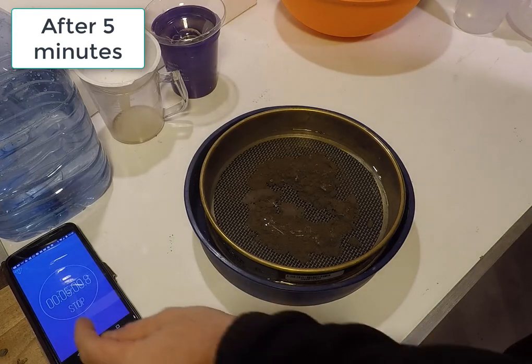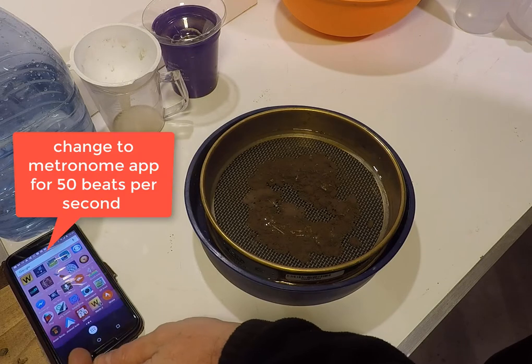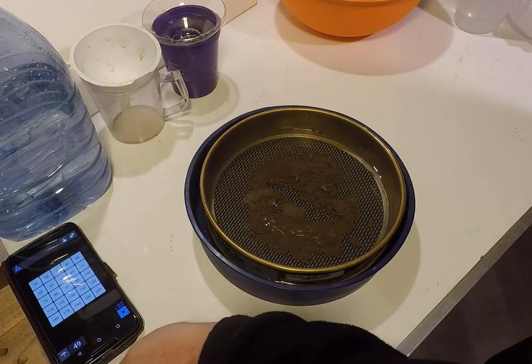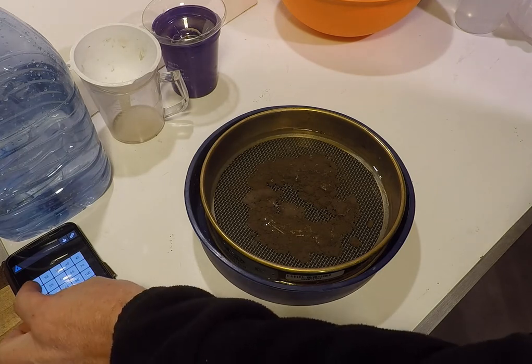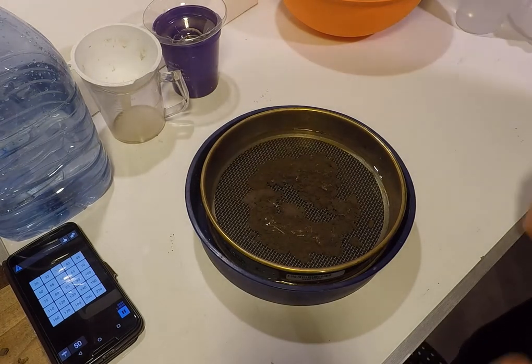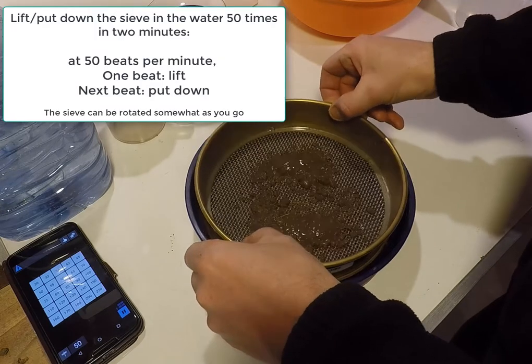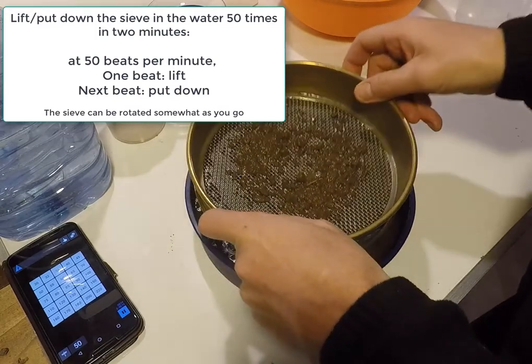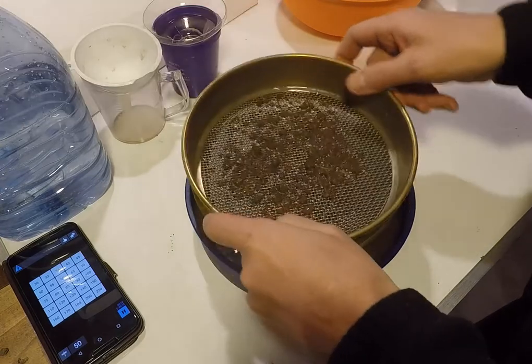After 5 minutes of soaking, the sieve is washed with an up and down motion, in and out of the water, 50 times in 2 minutes. A metronome app on a cell phone can be used at 50 beats per minute to time the washing. When using a metronome app at 50 beats per minute, the sieve should be put into the water on the first beat and then removed from the water on the second beat, according to the following rhythm.